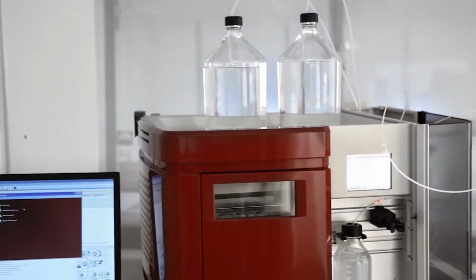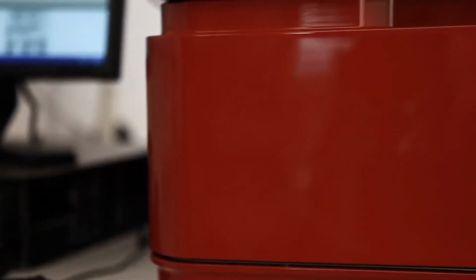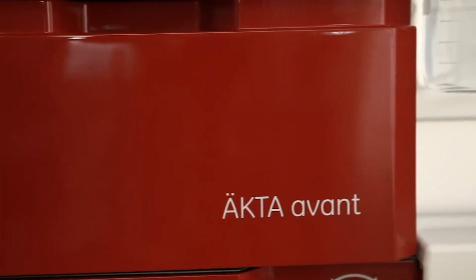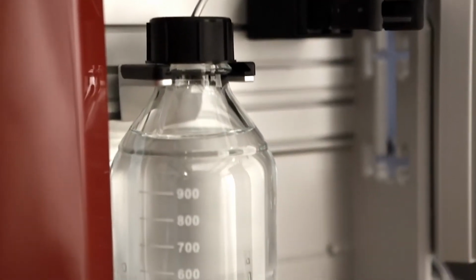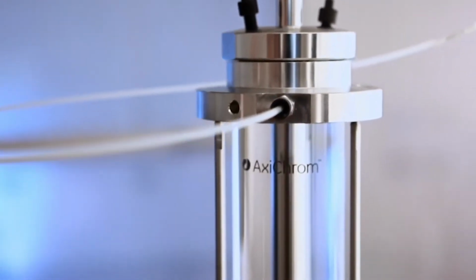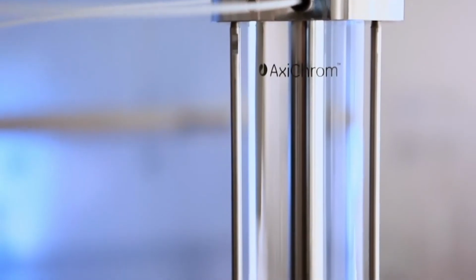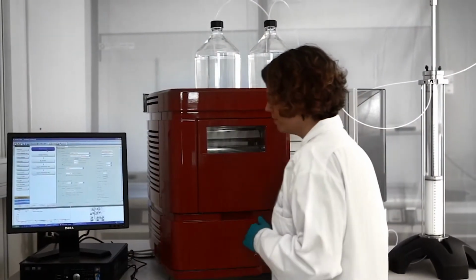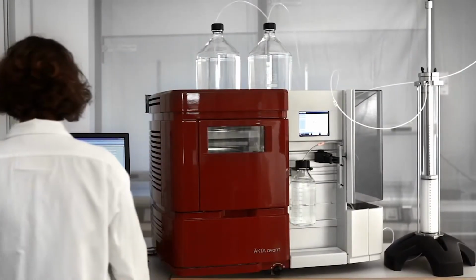AKTA Avant is a liquid chromatography system designed for fast and secure process development. AKTA Avant 25 is used for method development with small columns, and AKTA Avant 150 for scale-up columns such as AxiChrom 50 and 70. Here we show you how to pack an AxiChrom 50 column using AKTA Avant 150 and Unicorn 6 software.